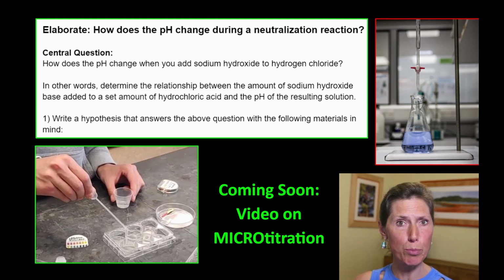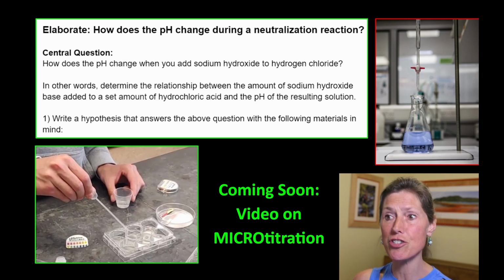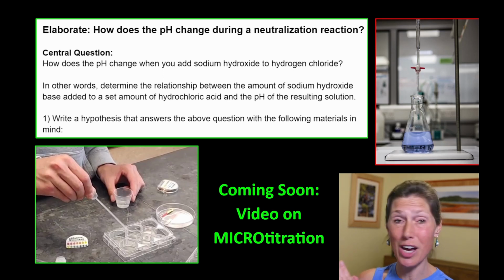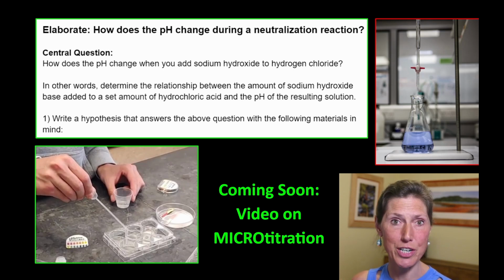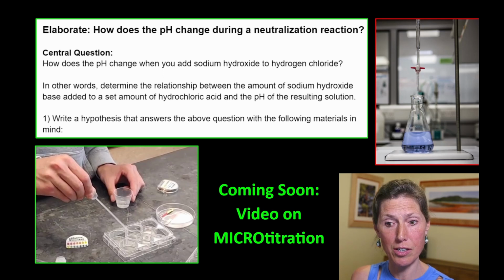As we did our Explore, we did our Explain, and that allows you to go into the next step. How does the pH change during a neutralization reaction? And my idea is to now not really use your regular standard titration setup. I wish to keep things simple for my students and instead use a well plate that they're going to place on top of a balance.